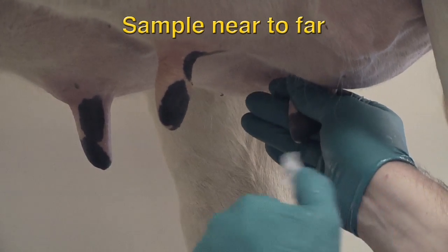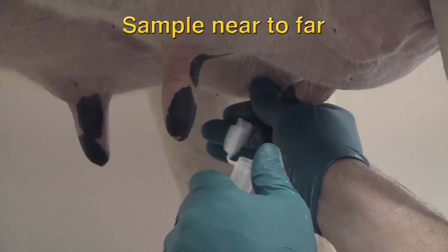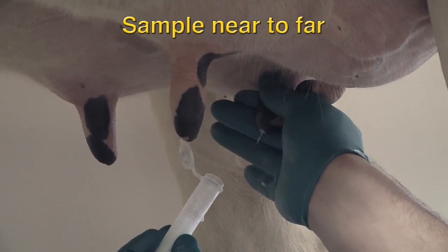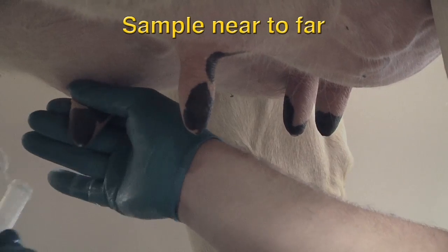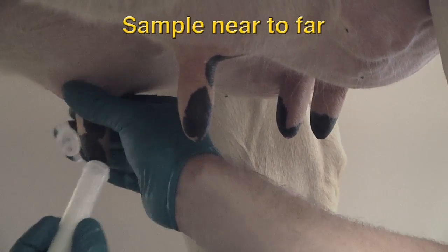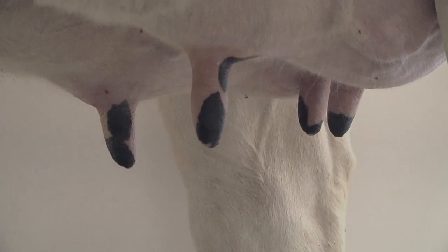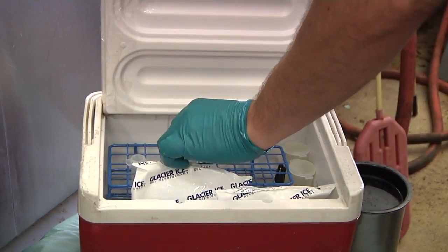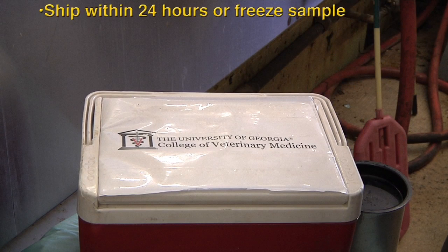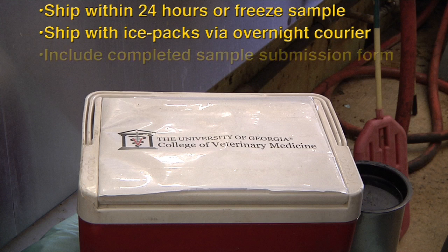Squirt out several milliliters of milk from each teat into the sample tube. Repeat the process for the other three teats, working from nearest to furthest. Close the sample tube and place it immediately in the cooler. Avoid overfilling the tube because the top may pop open when frozen. If the sample will not be shipped within 24 hours, it should be frozen. Milk samples should be shipped in a cooler with ice packs by overnight courier. Be sure to include a completed sample submission form.